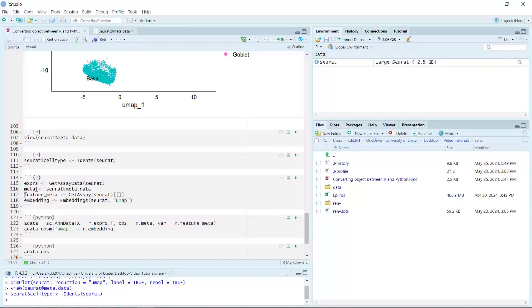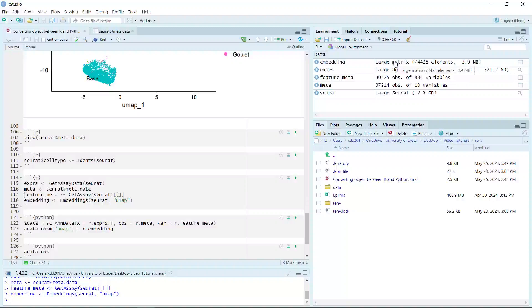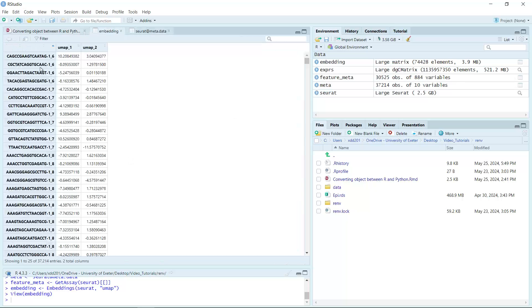Let's run the code to get the expression data, metadata, feature data, and UMAP data. Now you can see in our environment window we have the embedding information for the UMAP. If we click, you can see the row names are the cell barcodes. We have UMAP_1 and UMAP_2, and we have the feature data and also the metadata.